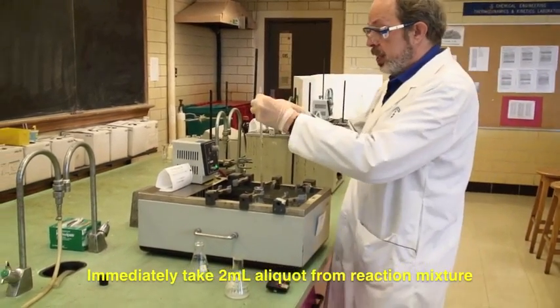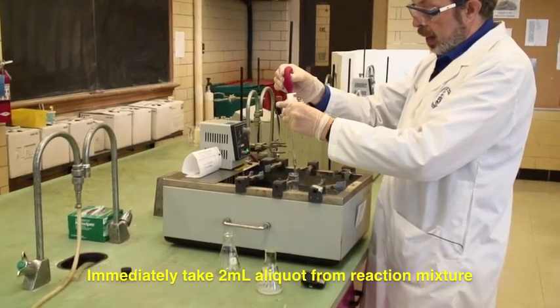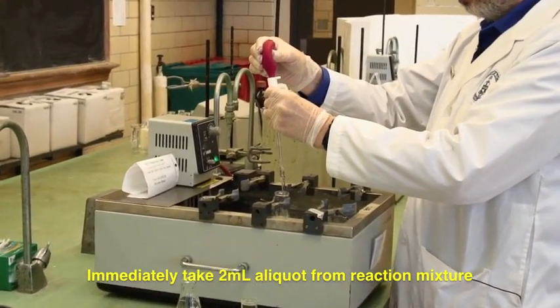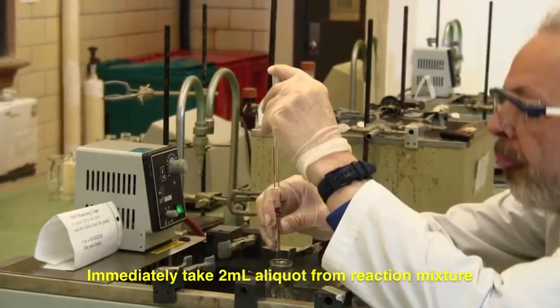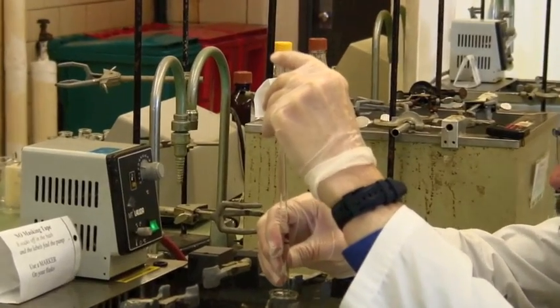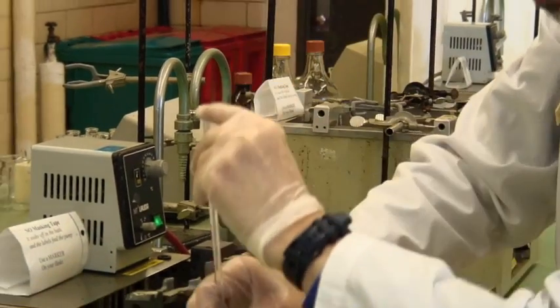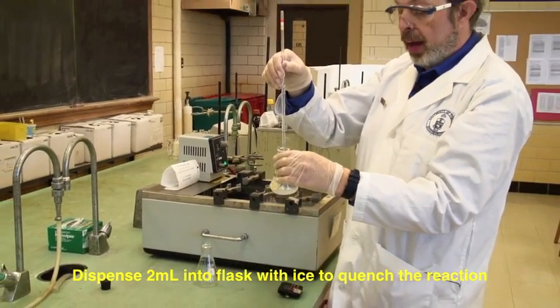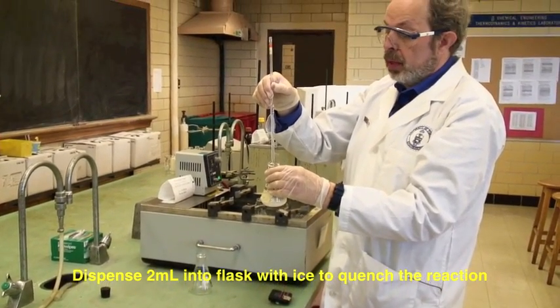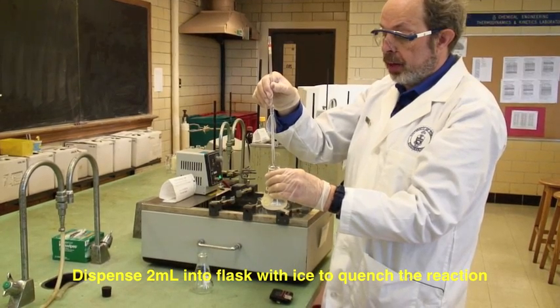Immediately, you want to take a 2 mL aliquot from the mixture. Place it into the flask with the ice and the water, and this has more or less quenched the reaction.